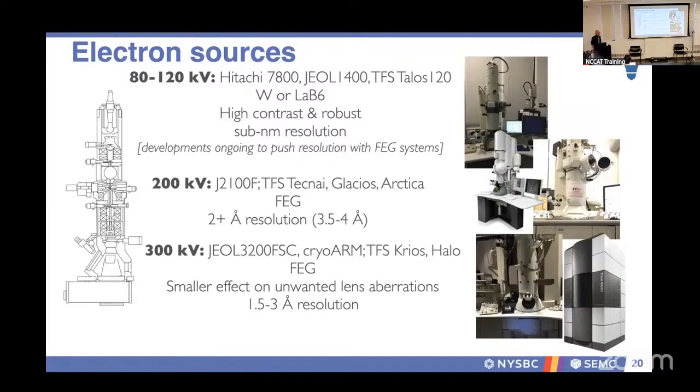Again, it's very dependent on what we were talking about yesterday on samples. However, all these microscopes, if you have a very good sample, we're not in material science, can actually all go subatomic. Unfortunately, our samples can't handle those doses.